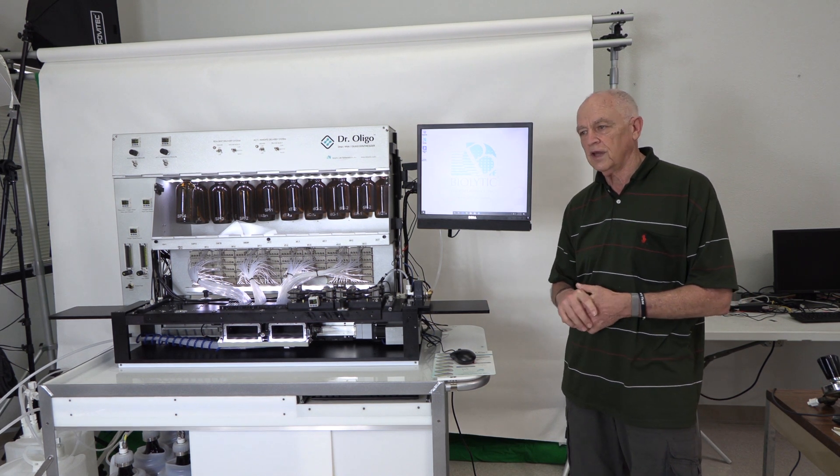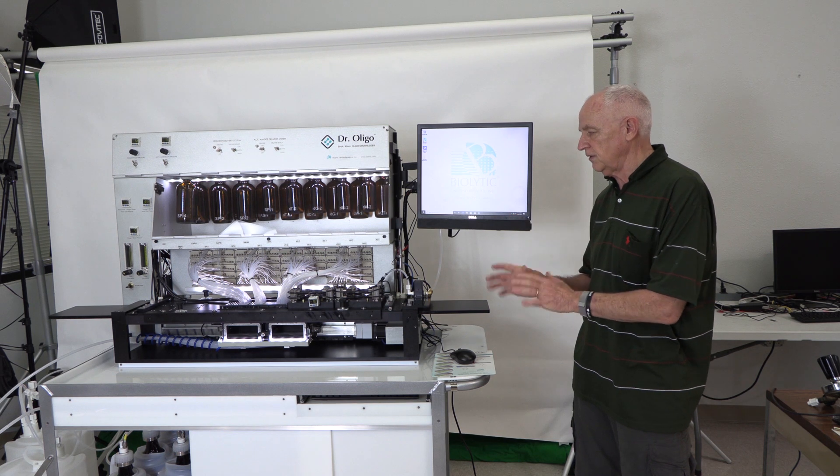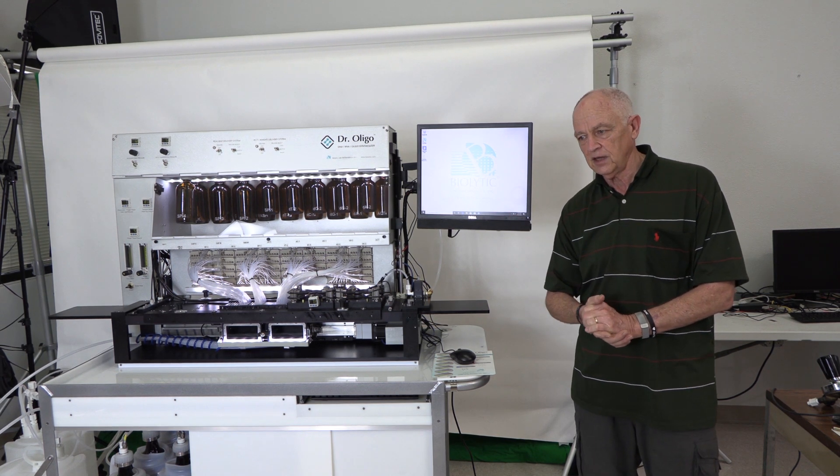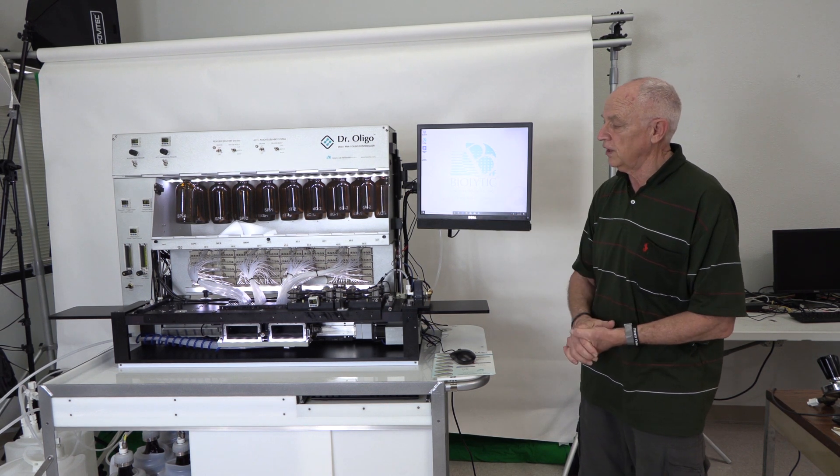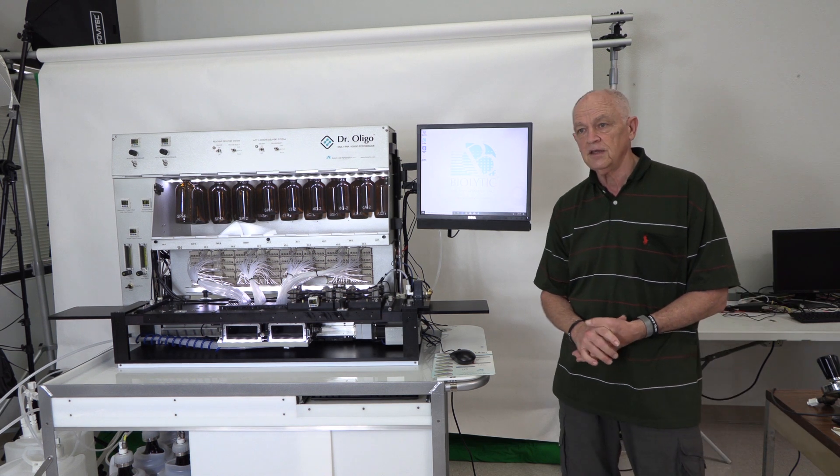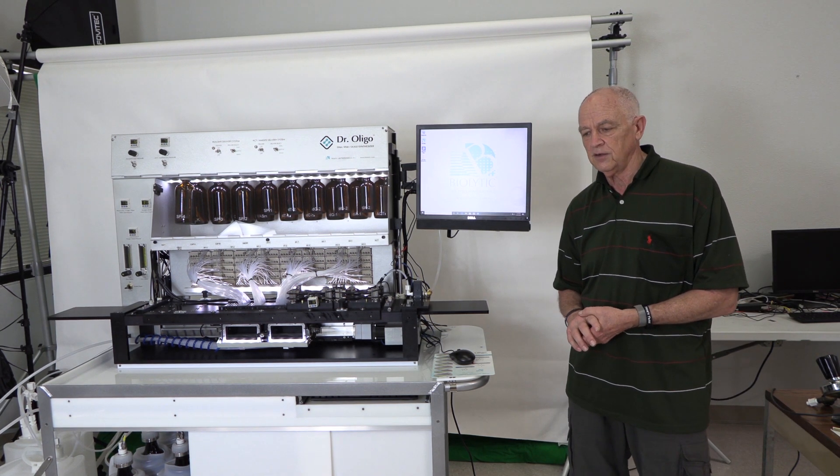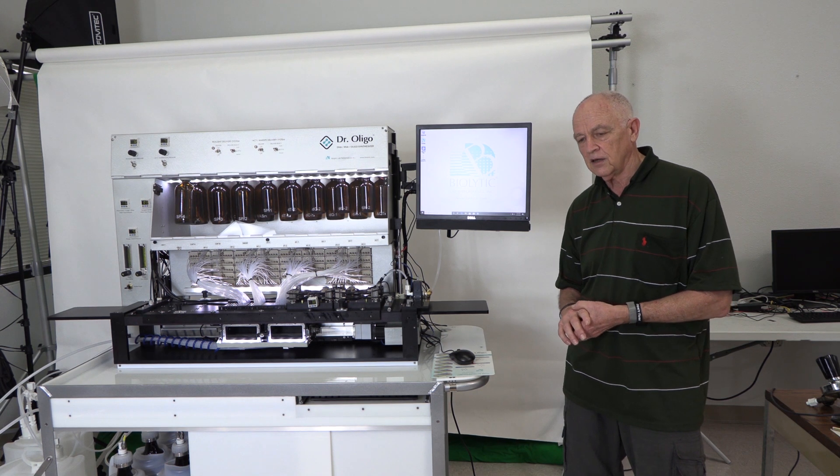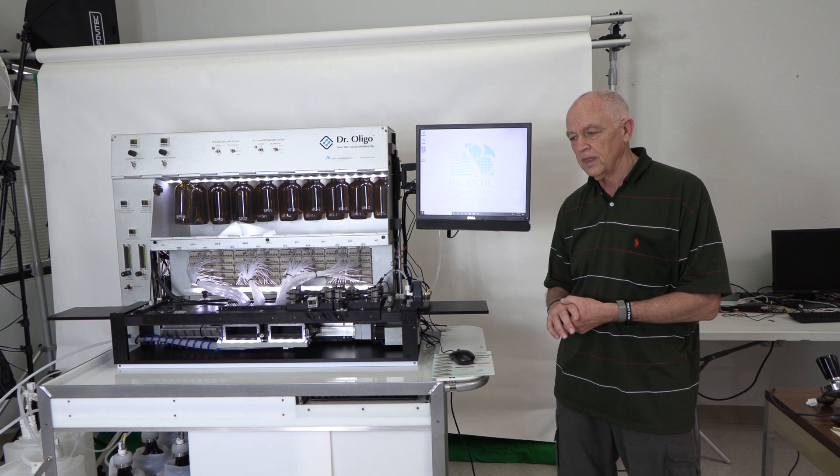We also have this same XLC model in a 768. This unit that we're looking at right now happens to be a 768. The differences between the 768 and the 192 are minimal and I'll point those out as we go through.